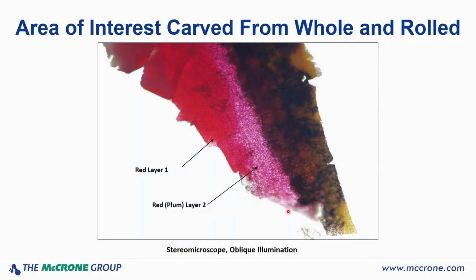Then I take that piece and I roll with the length of it. When I say length, I mean going with the layers. What happens is those layers will spread out and thin, and you can decrease the contamination across the smearing, if you will. So you can see pretty clear-cut areas here where you don't have any cross-contamination from one layer to another. Still not a very nice sample for infrared analysis.